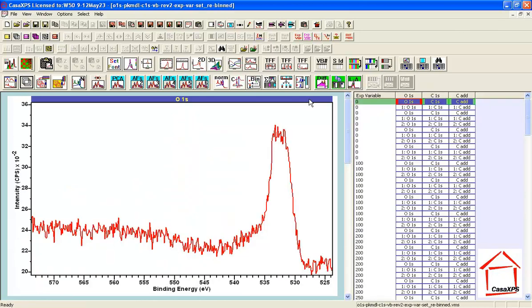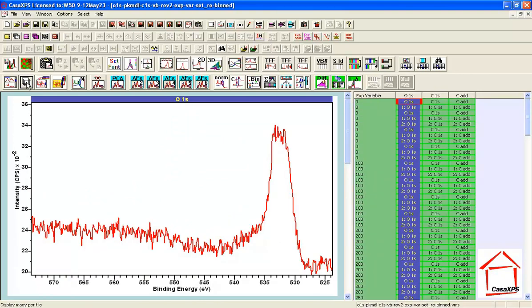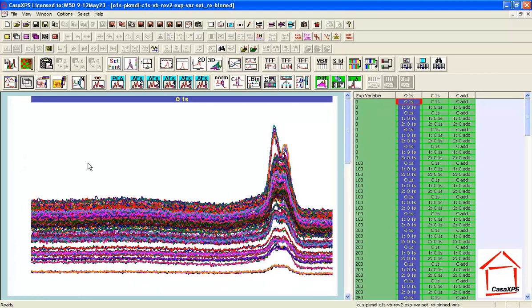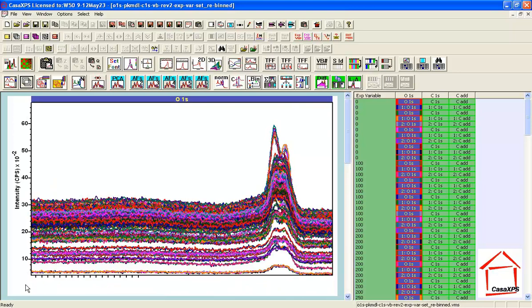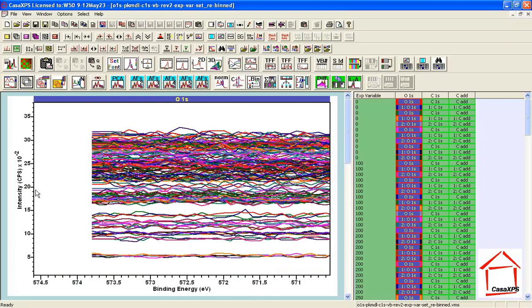By selecting all the VAMAS blocks and using the re-bin toolbar button, we can shift the signal throughout the data bins so that they all correspond to each other. After pressing this button, a new file is created and overlaying the oxygen spectra shows that each spectrum now has the same starting value and the same number of data bins — representing vectors that can be used in linear algebra.